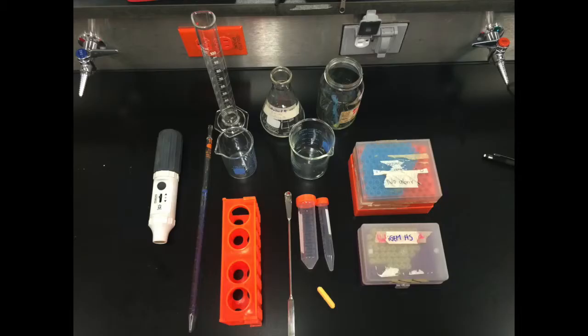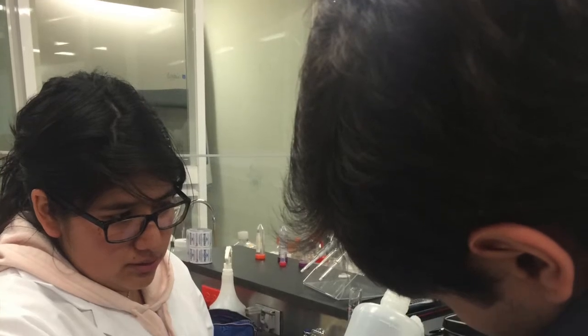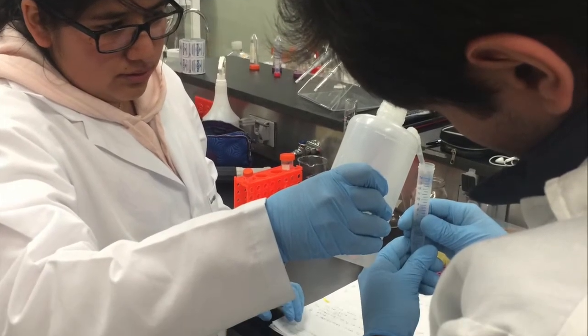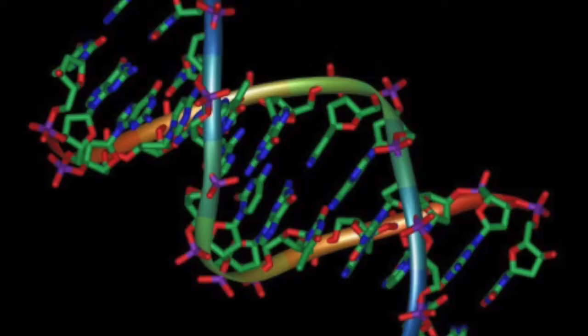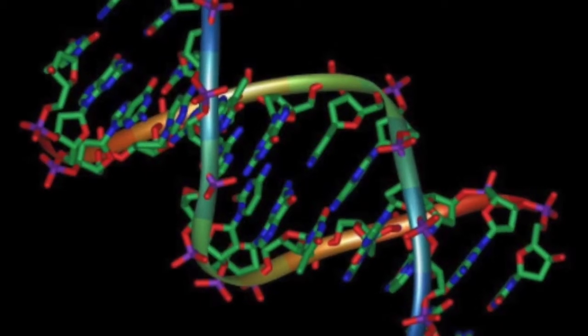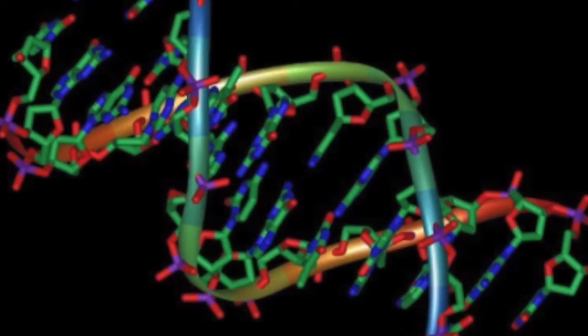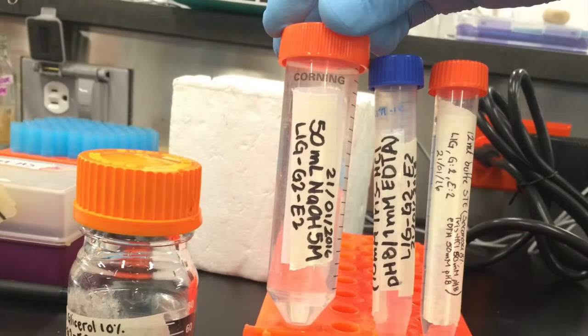In making solutions for use in biological experiments, controlling the concentration of solids in the solution is often critical. For example, failure to carefully control the concentration of solids in solutions used to culture cells can cause the cells to die or develop abnormally. Likewise, inappropriate concentration of solids in solutions that contain biomolecules may cause the biomolecules to denature or aggregate, thus making them inactive. Concentrations of solids can also affect the speed and size of chemical reactions that take place within a solution.